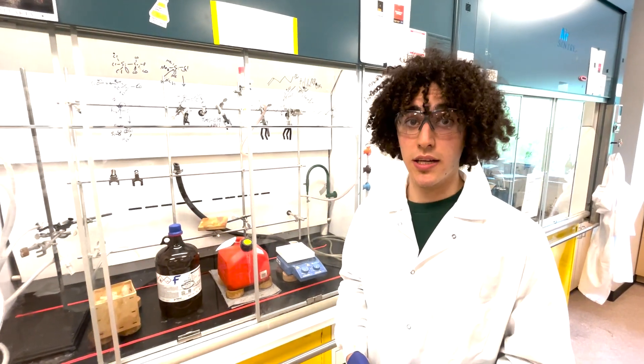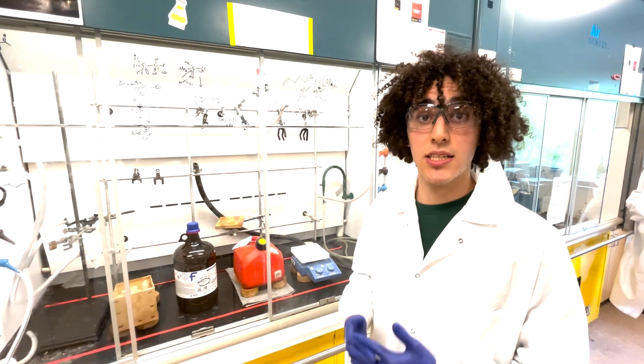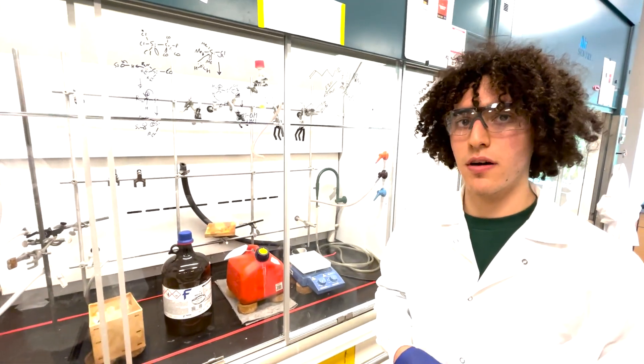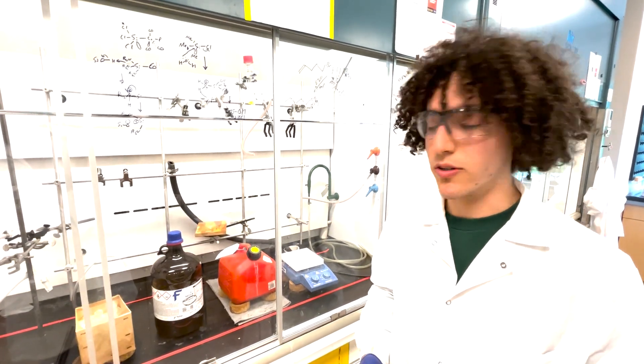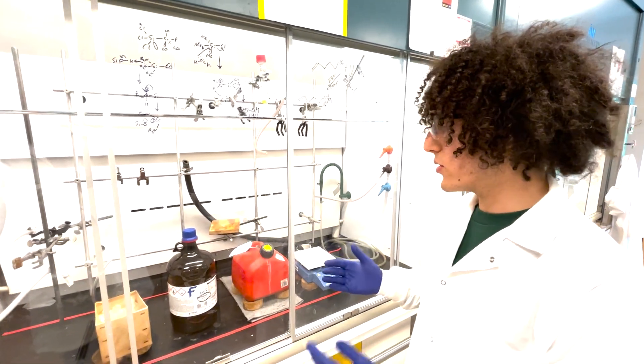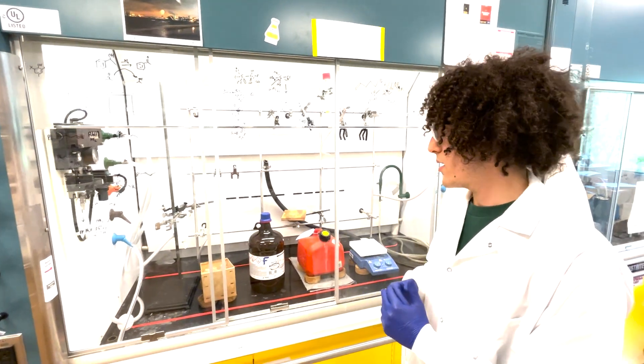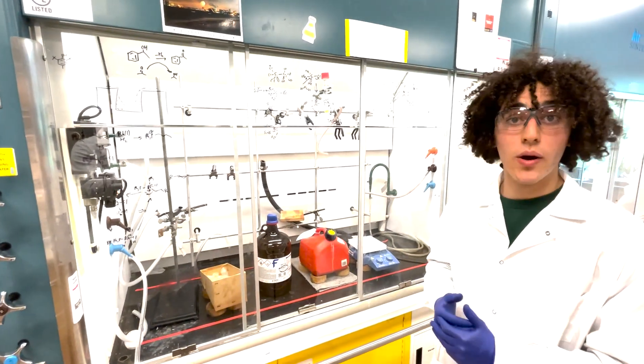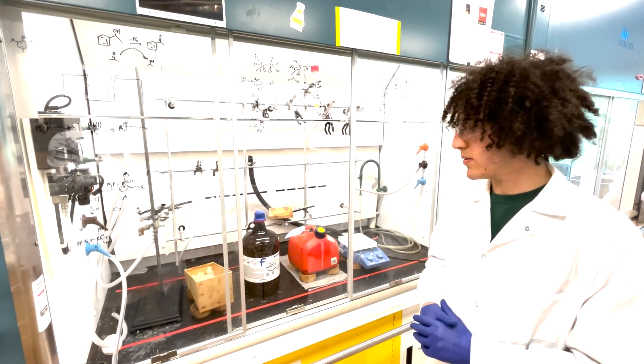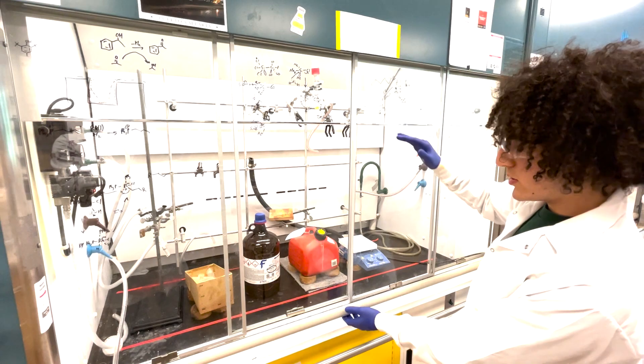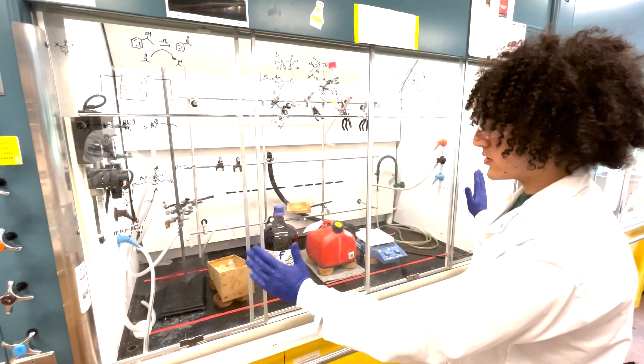In case of an emergency or a power outage, it is important that a researcher takes the necessary steps to prevent a buildup of vapors as the efficiency of the fume hood may have become compromised due to the power outage. So all chemicals should be covered so that vapor buildup is stopped, the reaction that was ongoing at the time of the power outage should be secured as effectively as possible, and the fume hood sash should be lowered all the way to the bottom and the horizontal sashes should be closed.